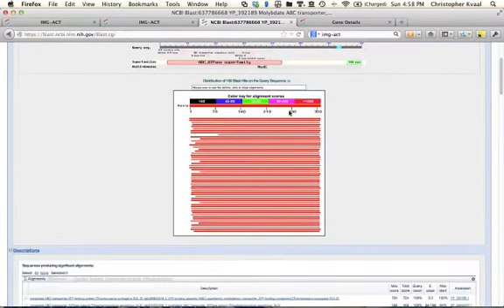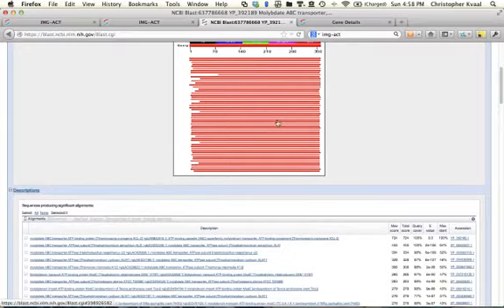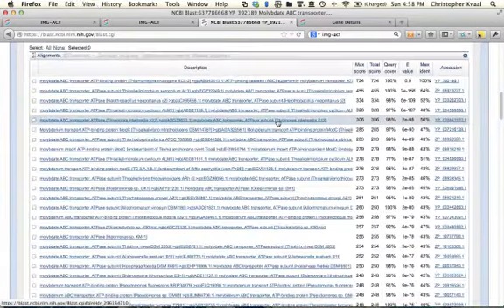What you're seeing is a color key, the score. We're getting a score, and that's what I'm really going to talk about at this point. We're getting a lot of really good hits, and this is very, very small, so I'm going to blow this up a little bit here.